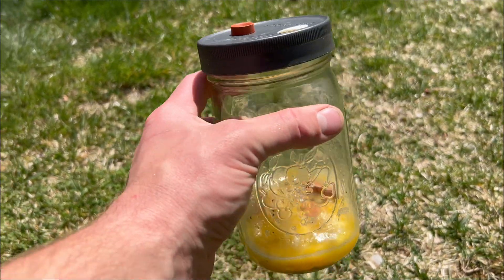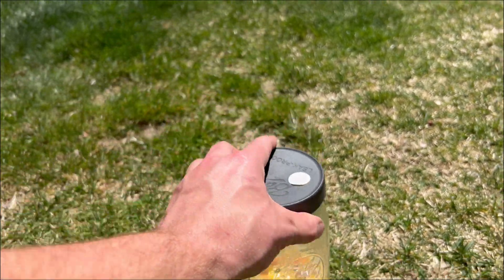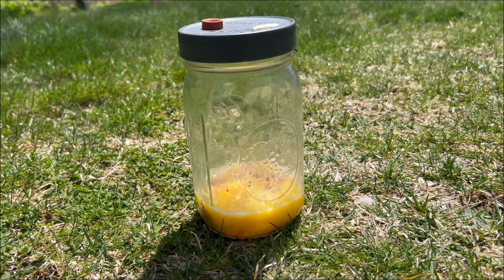Basically, the only things you need to grow cordyceps are some mason jars and some lids fitted with an injection port and an air exchange — usually a micropore tape or just a filter patch — so that the mushrooms can breathe oxygen and release CO2. You need some eggs and an oven. And last but not least, the cordyceps militaris liquid culture.